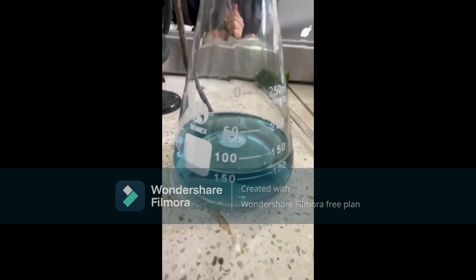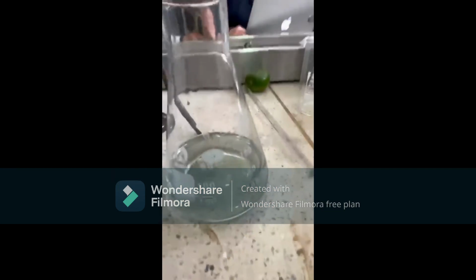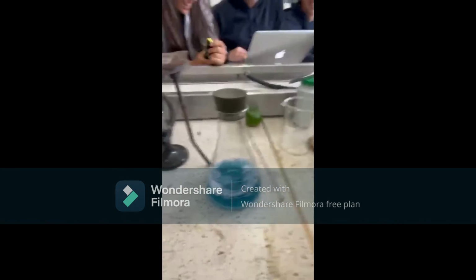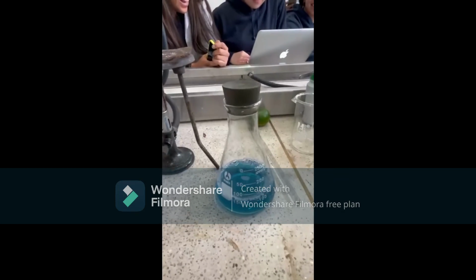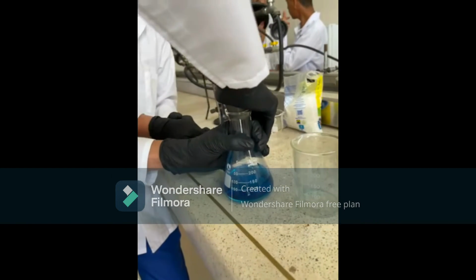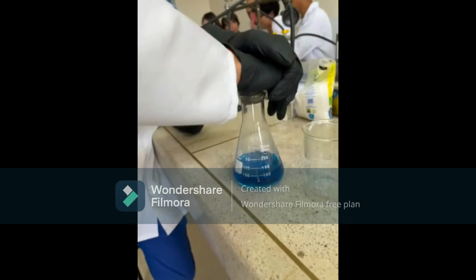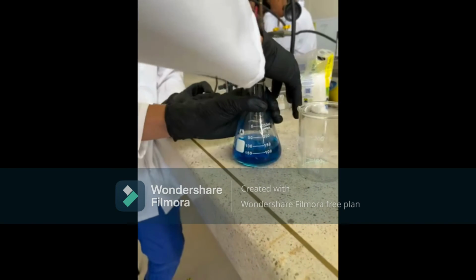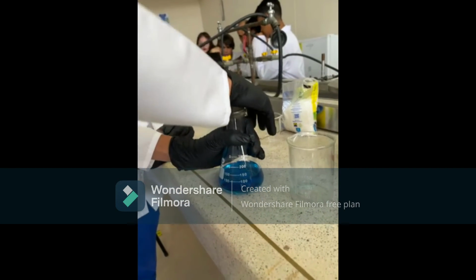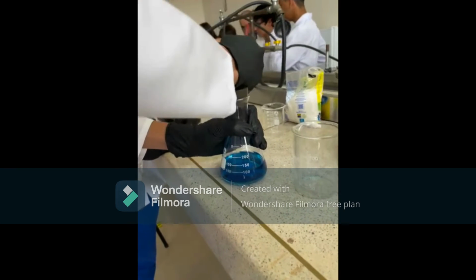Regardless, the color was still a light blue. The time was a little bit slower, passing from the oxidation to the reduction state not in 3 seconds, but in 8 probably. And after repeating 4 or 5 times, the color was not a light blue anymore, it was a dark blue, and the time to pass from the oxidative state to the reductive was even longer, probably 30 seconds.